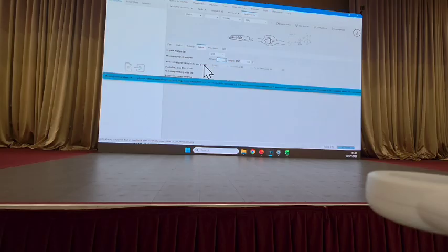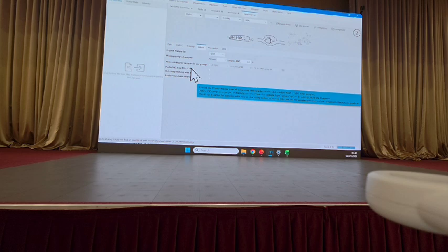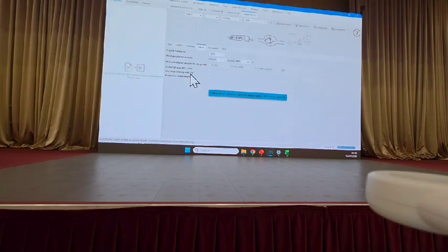This is, again, the same concept, but looking at the metadata column. You do not need to worry about that right now. This is if you're using pooled QC, another filter. We're not using that right now, so we'll not go into that. This is the filter. Let's say you have a peak, but that peak doesn't have a corresponding C13, so isotopic peak, maybe it's a lower intensity metabolite, it will get discarded. We don't want to do that, so we'll keep that unchecked.